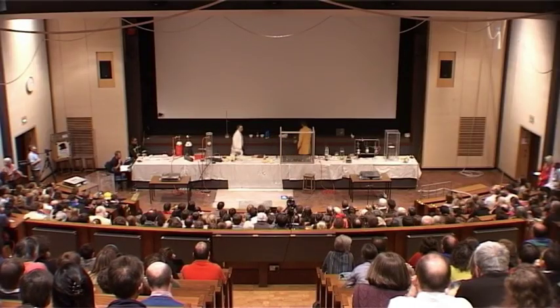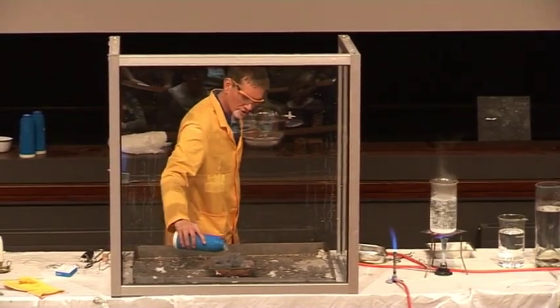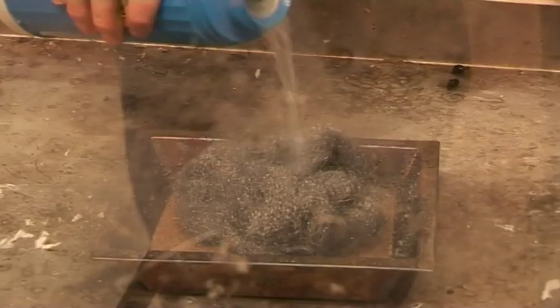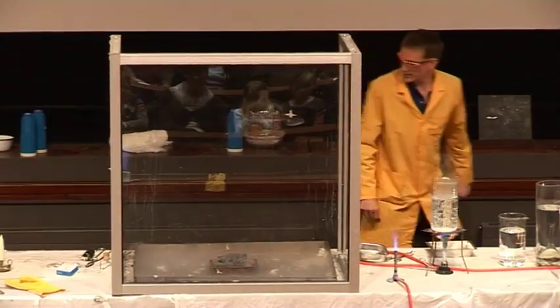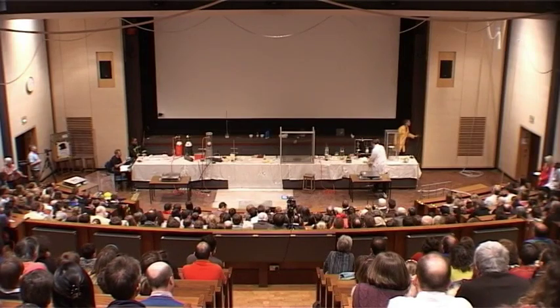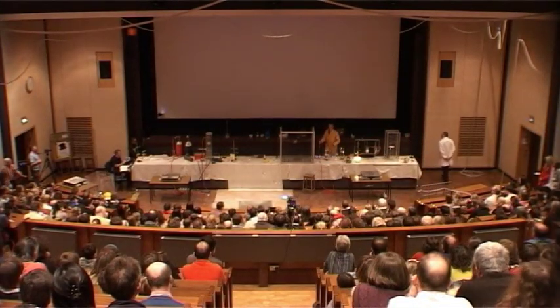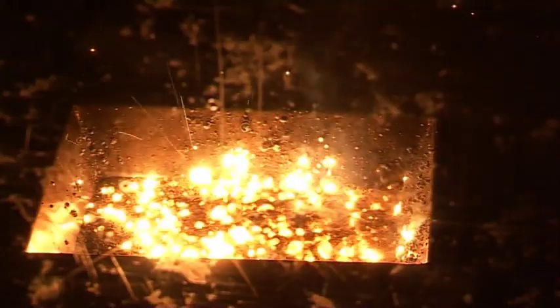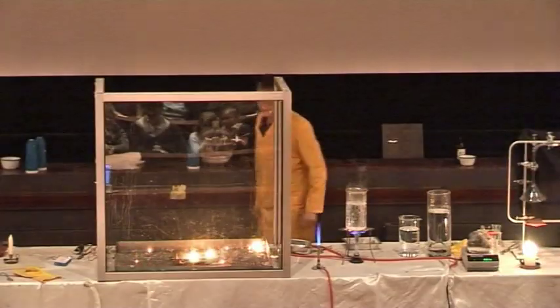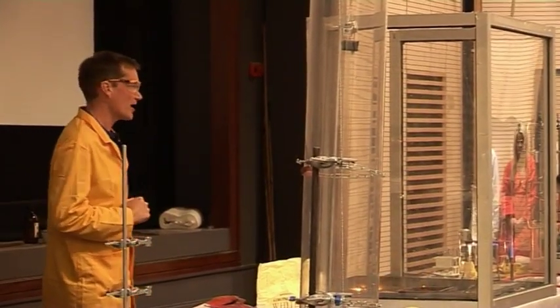So we're going to give this some more concentrated oxygen, liquid oxygen. And if we just have the lights down in a second. So this is iron reacting with oxygen, if my candle can stay alight. There we are. Okay, so there we are. Even the iron can burn by combining with the oxygen from the air.